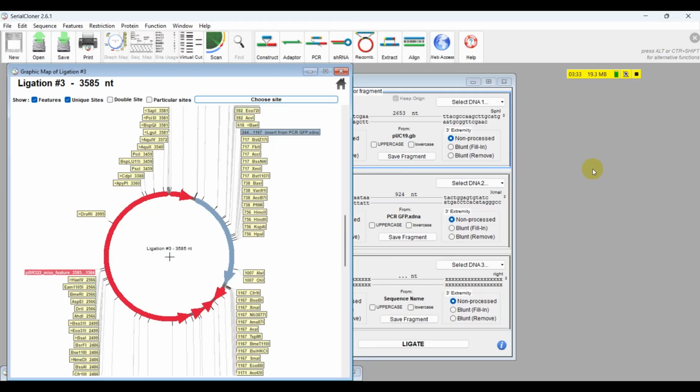And one thing you need to remember, that protein cannot be replicated, but gene sequences can be replicated. That's why we are inserting the gene, not the protein. Although green fluorescent protein, shortly GFP, has protein in the name, here I'm dealing with the gene sequences. So here the gene is being replicated, not the protein. For expression of protein, we need the expression vector. There the protein will be expressed but not replicated.